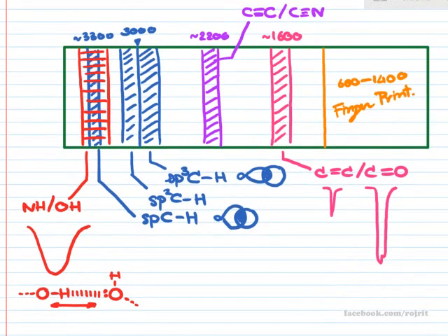But anyway, the alkyne appears in the same region as NH and OH, but the shape of the absorption is different, because with NH and OH you have hydrogen bonding. This hydrogen bonding, where the oxygen drags your hydrogen atom out a bit, means the OH bond distance is varied. So what we can observe is the broad absorption. This is the characteristic absorption of NH and OH, or anything that can have hydrogen bonding. And the bond strength and bond length can be varied by these interactions.